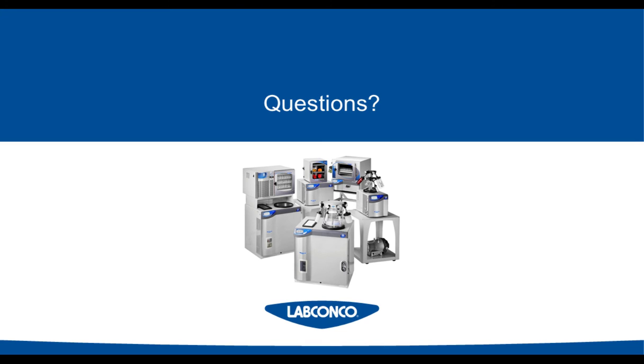Great, thank you. Now, would you recommend lyophilizing products in 96 well plates? And if so, how would you be able to control the exposure once the door is opened? Well, 96 well plates can be tricky to freeze dry because there's a couple things. First of all, the samples are typically very, very small.